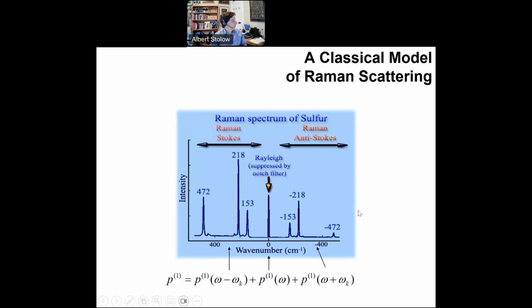So directly from this inelastic scattering of light, I get information about the shifts, which are directly related to vibrational frequencies. This is nice because I can use visible light, which is what we would like to use in biological imaging, to get information about vibrations, which allow me to identify molecules in a very natural way by their vibrational frequencies without adding any dyes or stains.